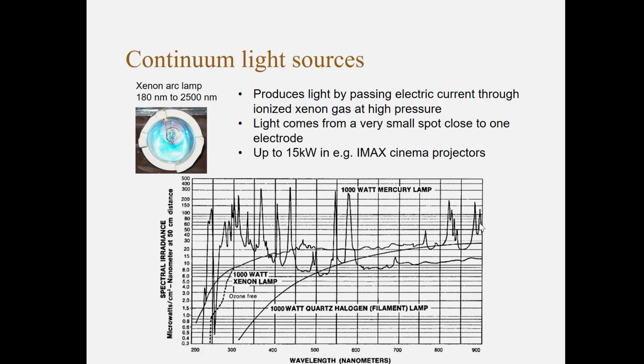We have thermal emission from this very hot plasma, and thermal emission from the hot electrode, which is at longer wavelengths. And then we have emission lines from the xenon gas inside the light. If you want to detect something where you have a strong emission pattern from the light source itself, that's of course much more difficult. If you were to use the xenon light in this region, that wouldn't be so easy because it has a very strong spectral feature itself, and you have to be able to separate the spectral feature of your light from the spectral feature of a sample you would like to analyze.